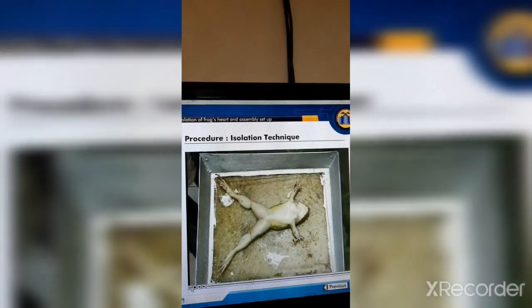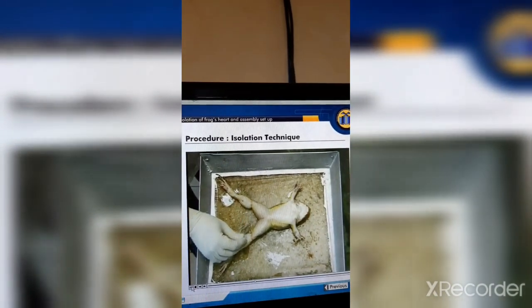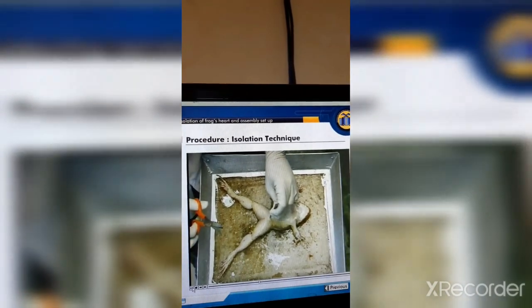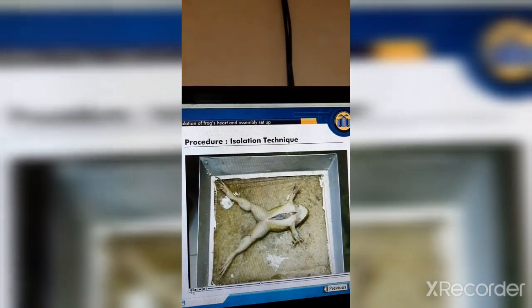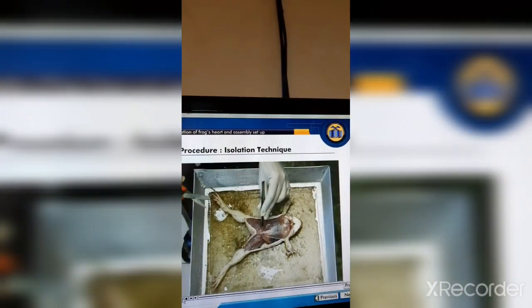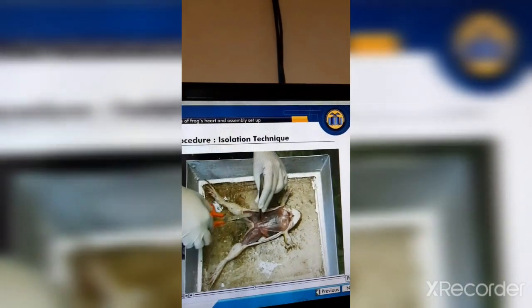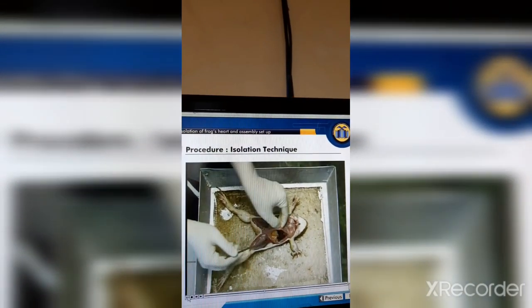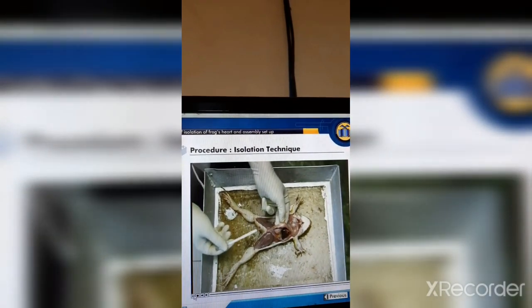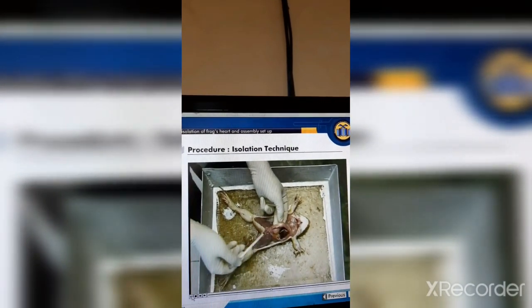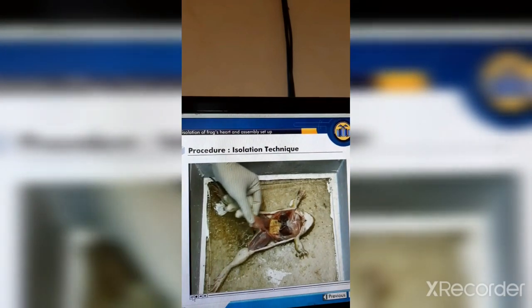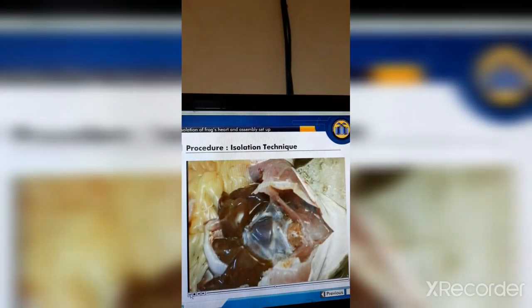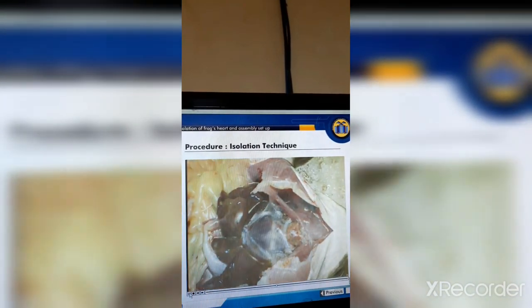Pin the limbs of the frog to the dissecting tray. Remove the abdominal skin with a sharp scissor and expose the abdominal muscle. Cut on each side of the abdominal muscle up to the pectoral girdle. With the help of fingers, separate the blood vessels to avoid loss of blood and expose the heart. You can observe rhythmic heartbeats. Remove the pericardium, that is the thin outer membrane, without damaging the heart.